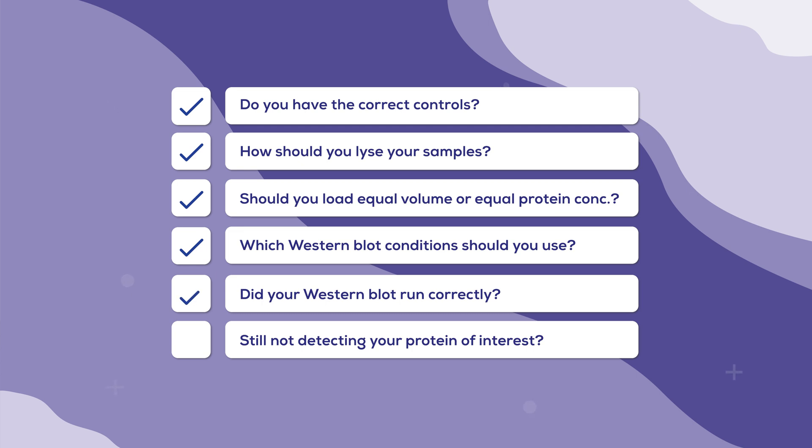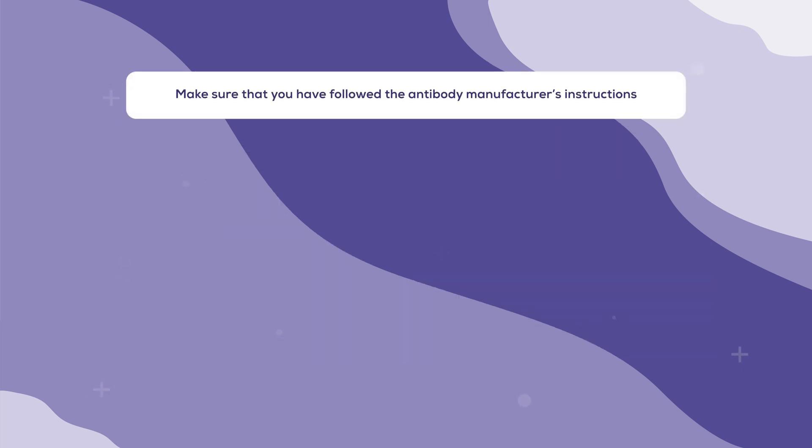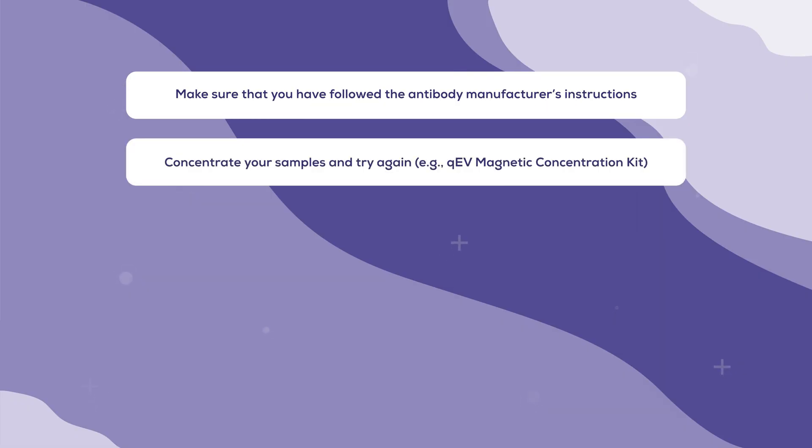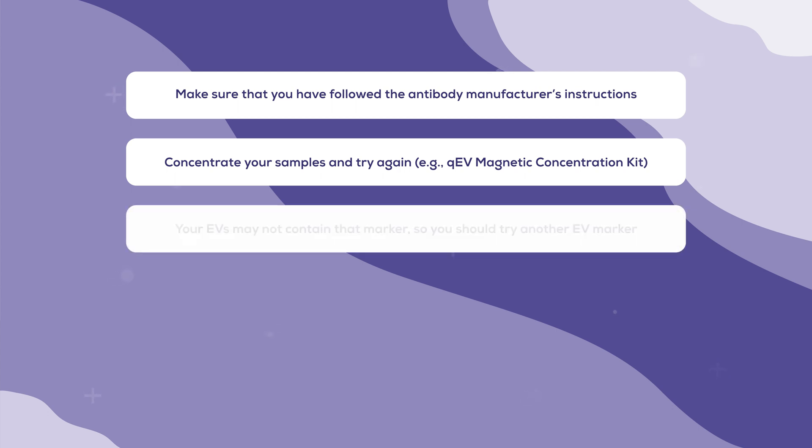After washing off your reversible membrane stain, the next step is to use antibodies to detect your protein of interest. This should be done using the protocol provided by the antibody manufacturer, as hopefully they have done some quality control testing. However, it is likely that this protocol will require some optimisation in your hands to achieve the best signal. If you do not detect the protein of interest, you can try concentrating your samples and try again. If still absent, your EVs likely do not contain that marker. The literature shows that not all EV isolates are positive for all tetraspanins. CD63 appears to be particularly difficult to detect, and so CD9 or CD81 may be used instead.